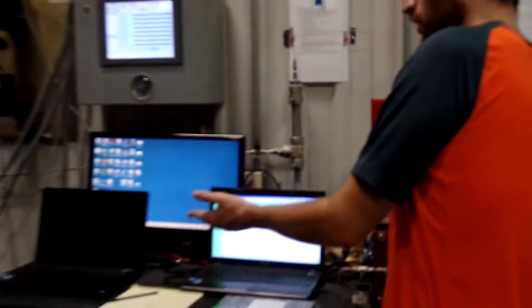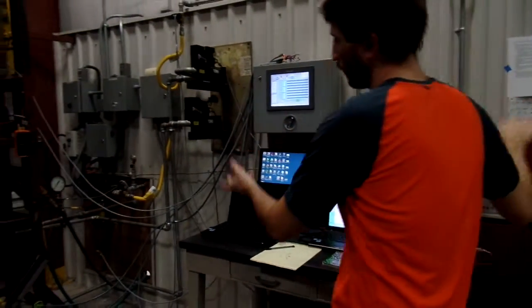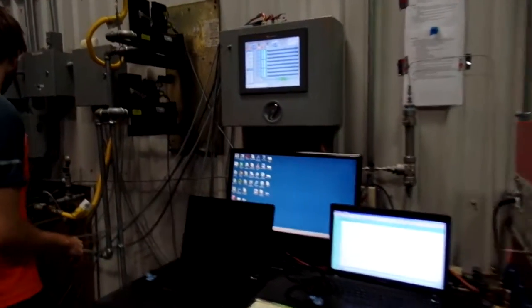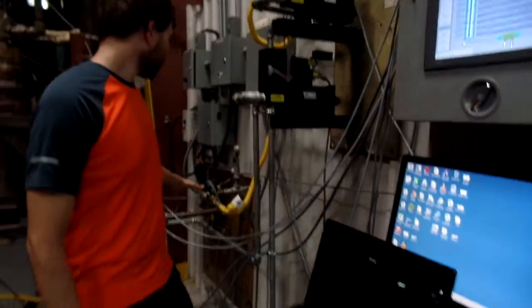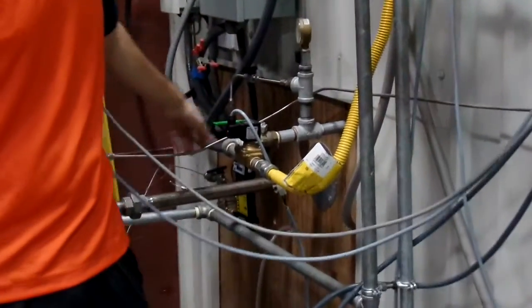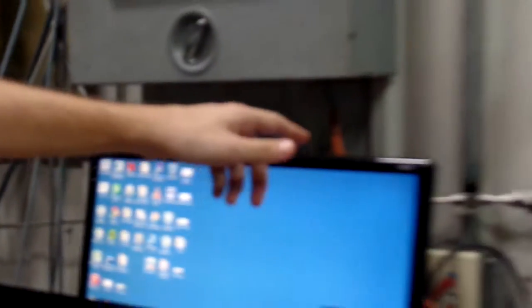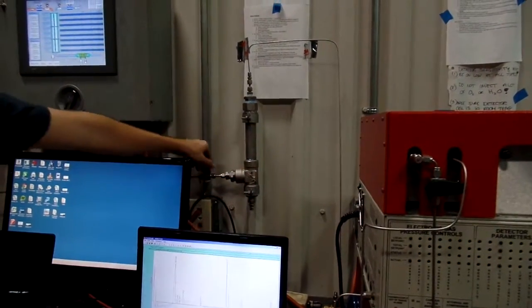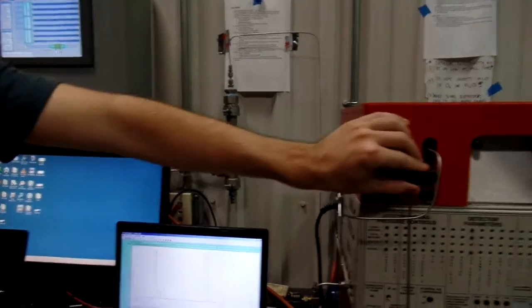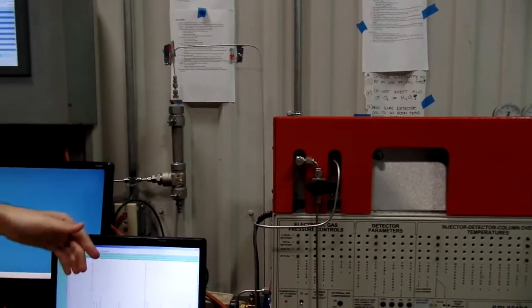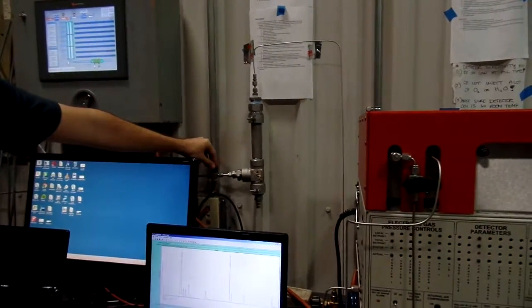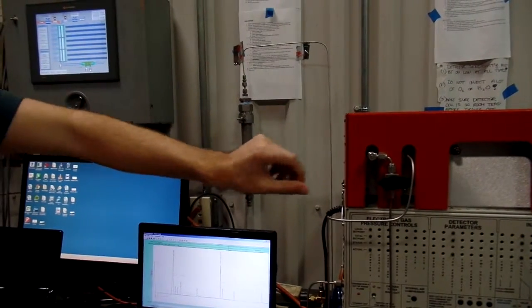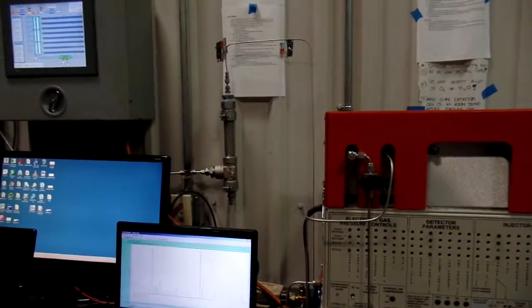While the system's on, gas is going to be flowing throughout the whole thing. All these pipes are connected. So the flow out of here splits right here and heads towards the GC coming this way. You have two valves to shut before it gets to the GC. These are already shut here and here. You can tell you know valves. You're not stupid. So when you want to run this and it's on, you just open and open.